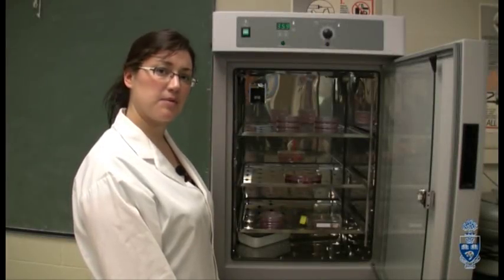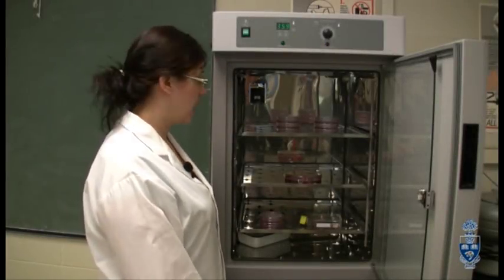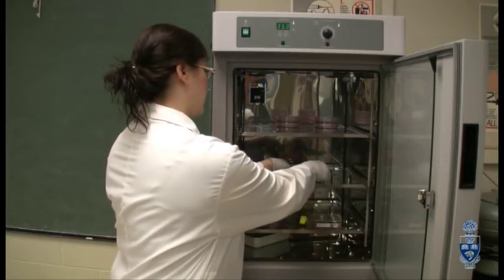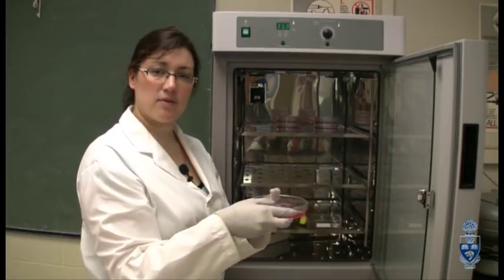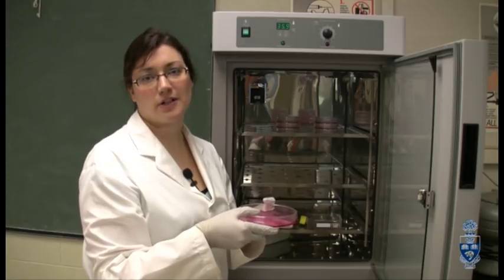As you can see, there are many cell types being cultured in this incubator. Our cells are the MCF7 cells. And now that we have them from the incubator, we can take them and passage them in the flow culture hood.